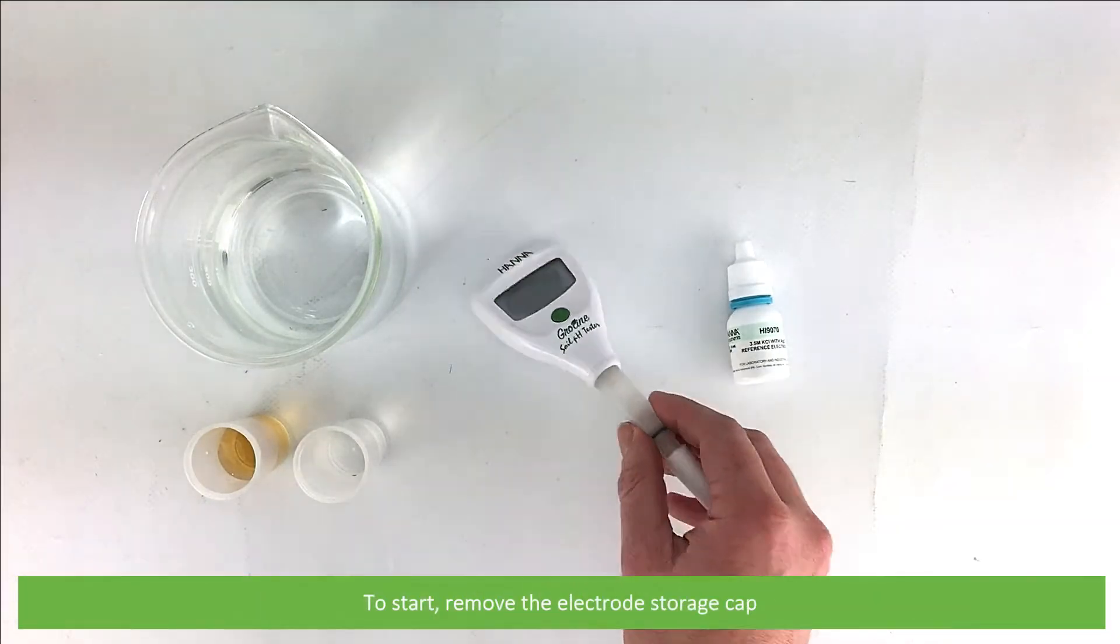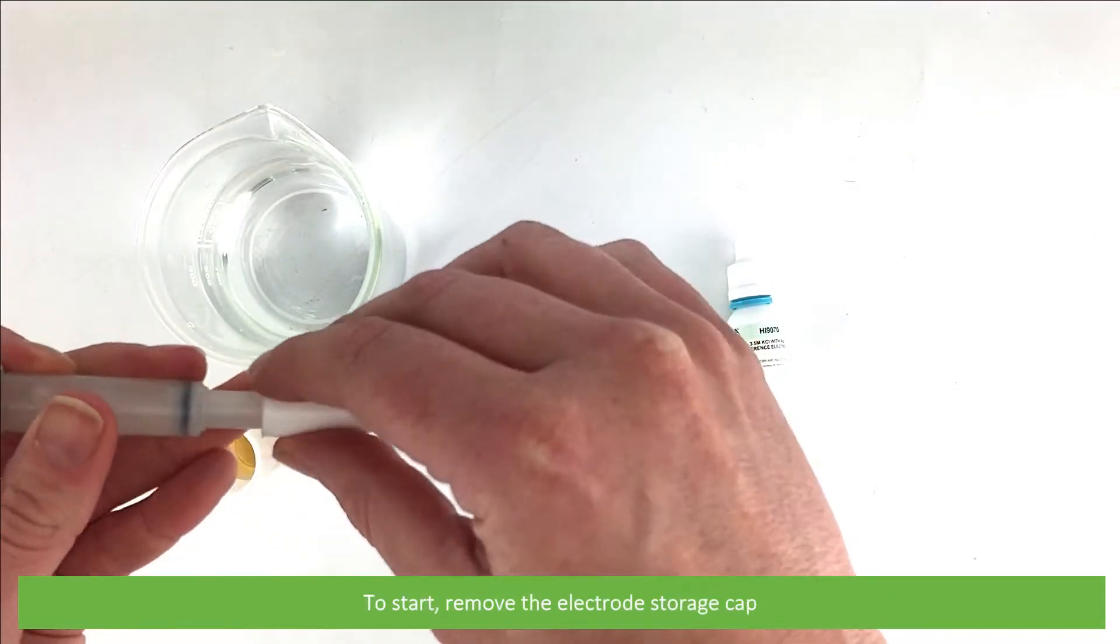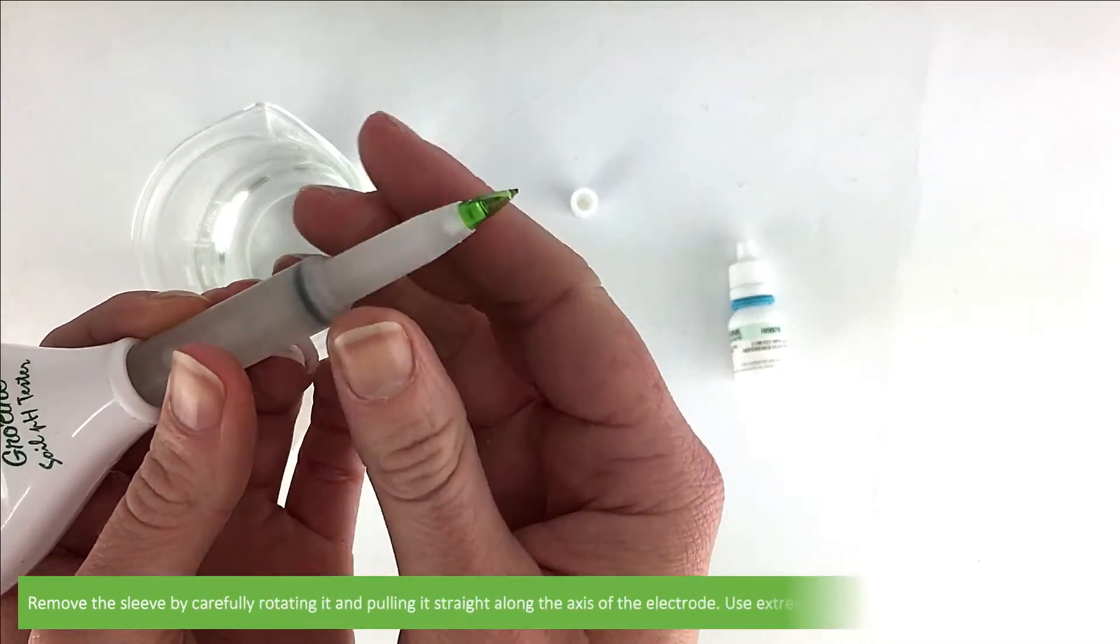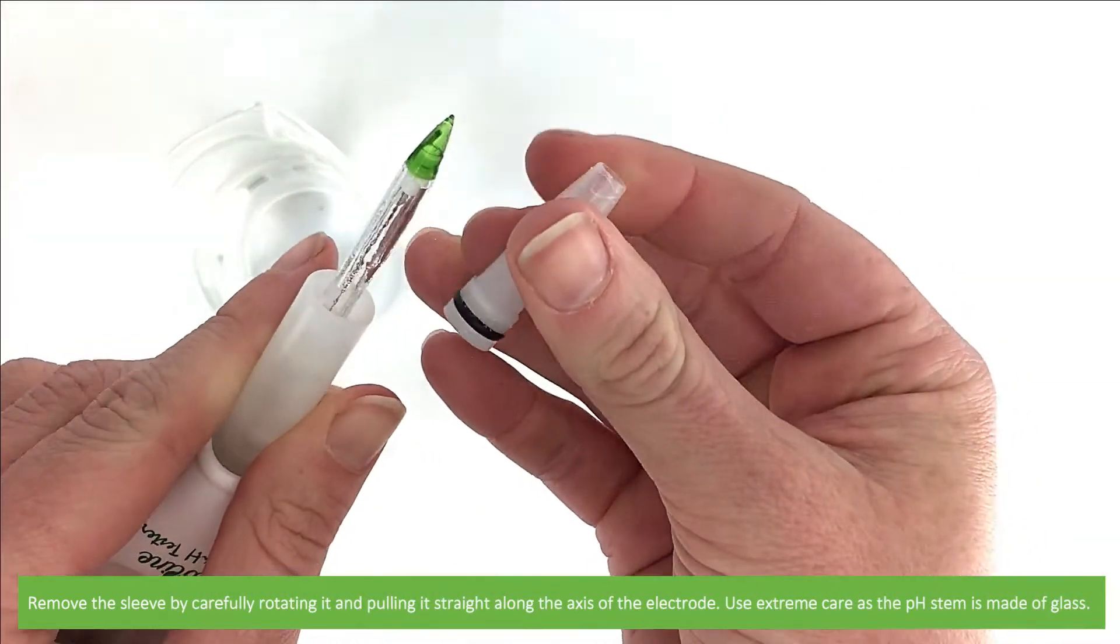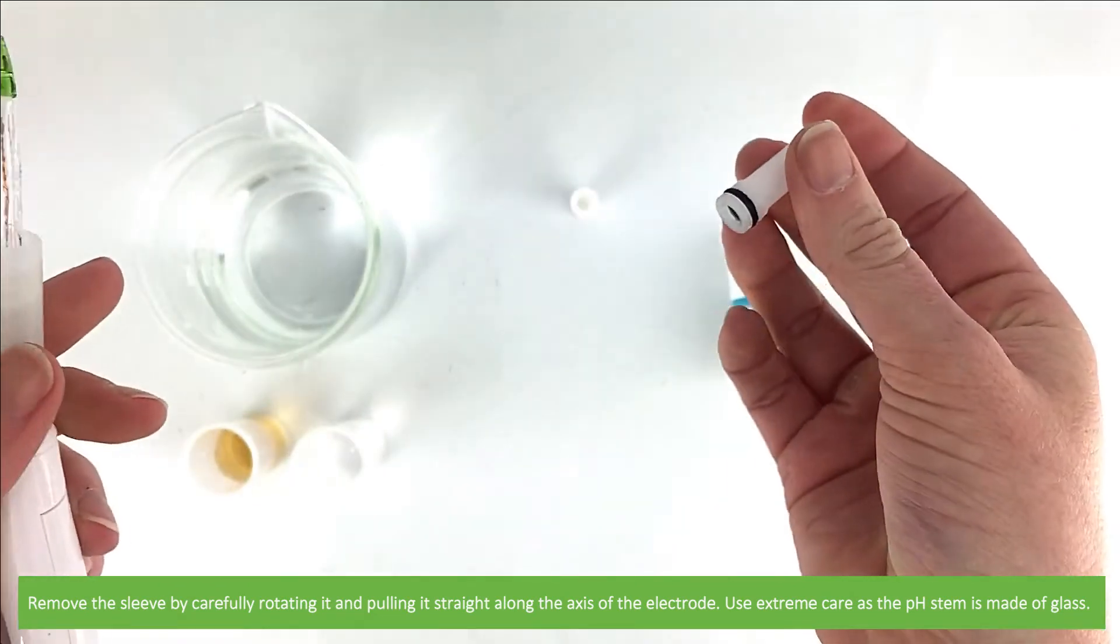To start, remove the electrode storage cap. Then remove the sleeve by carefully rotating it and pulling it straight along the axis of the electrode. Use extreme care as the pH stem is made of glass.